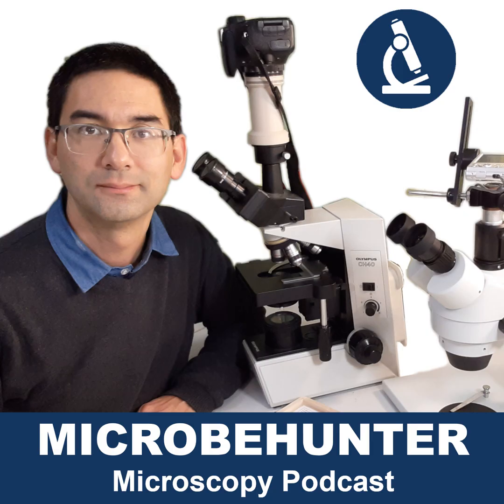Okay, phase contrast is a little bit cheaper, but also not so easy to get. You have to either buy this equipment secondhand, like I did here. That's a phase contrast microscope which I assembled together from used parts that I bought over eBay. So the price was reasonable. But if you want to buy this new, it's also going to be quite costly, and you have to talk to brand microscope manufacturers who offer these microscopes. Generally, you will not find this in the low-end educational sector. Okay, so that is one thing.